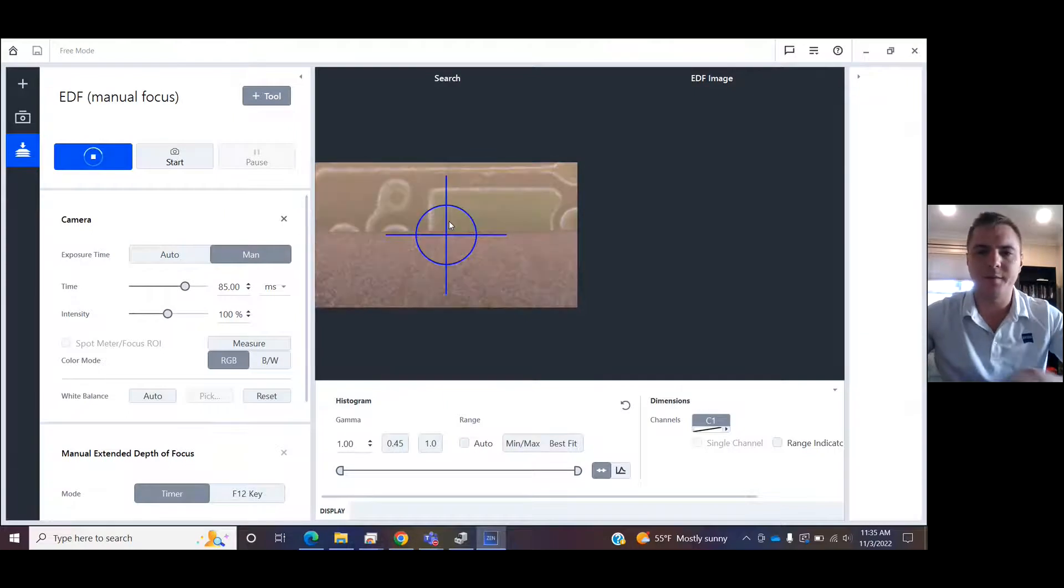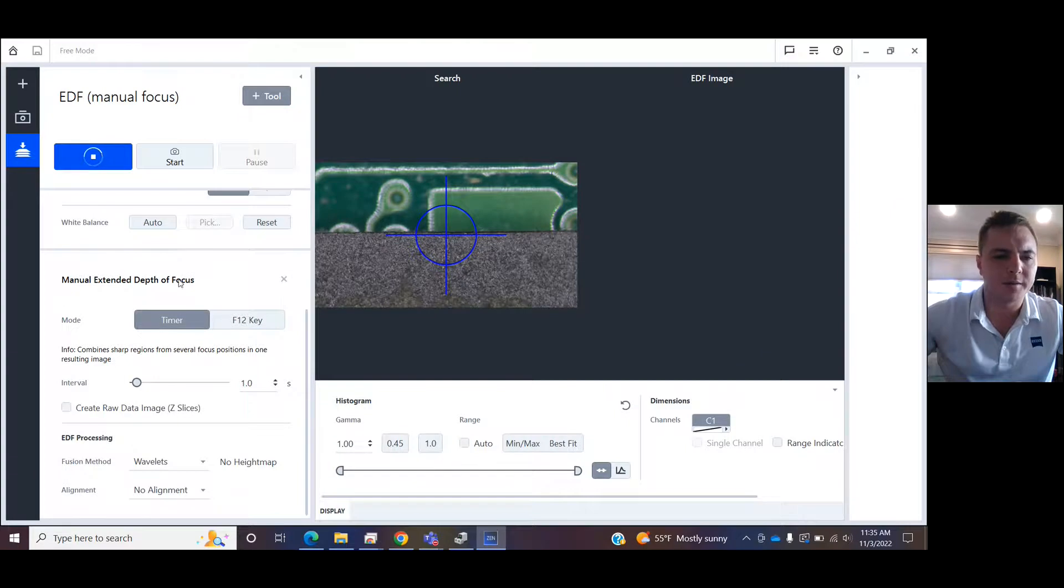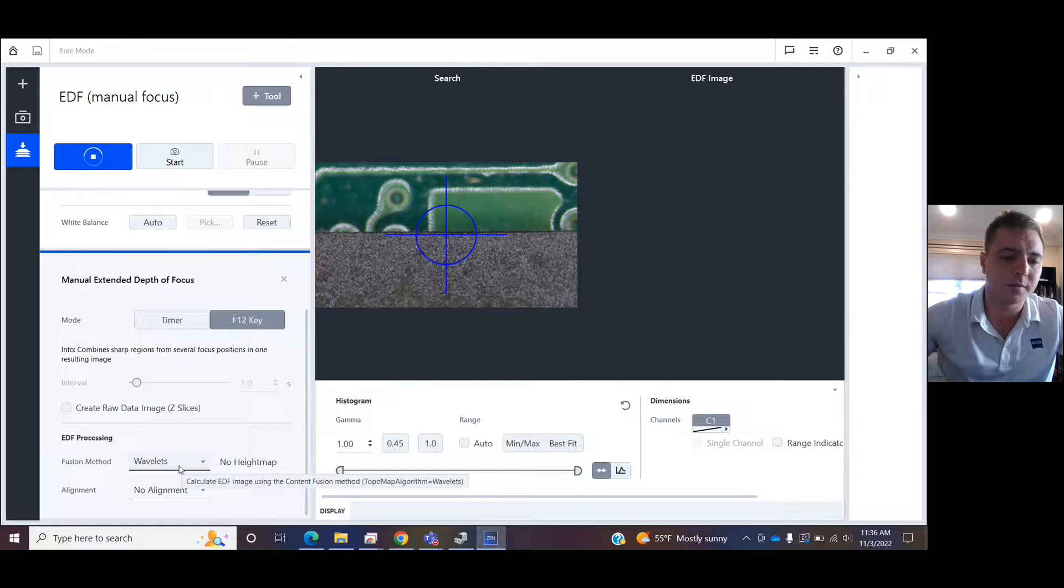image right there. I move my hand under, we see that. I can come down here to Manual Extended Depth of Focus, and we have two different methods for taking this. I'm going to use the F12 key. You can choose a fusion method and an alignment. For a Greenough stereoscope, you might pick High or Highest.